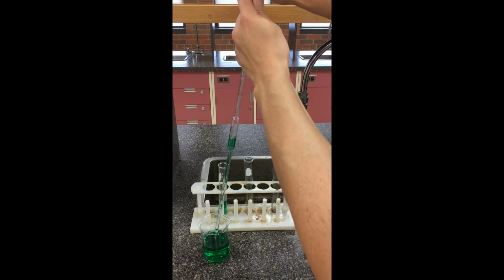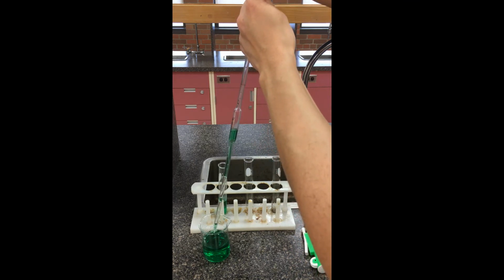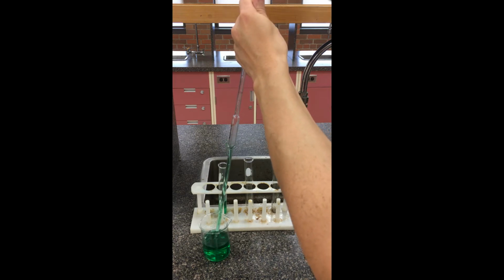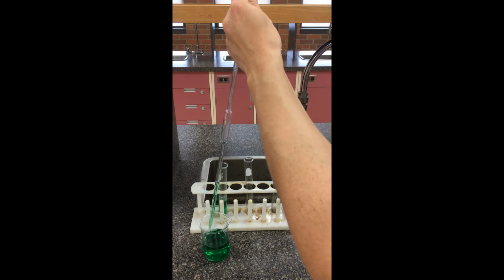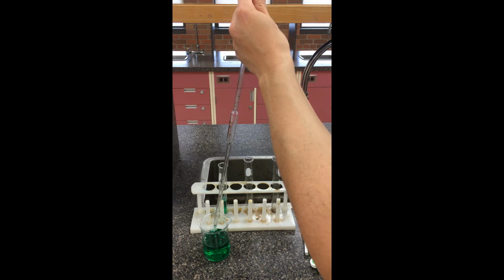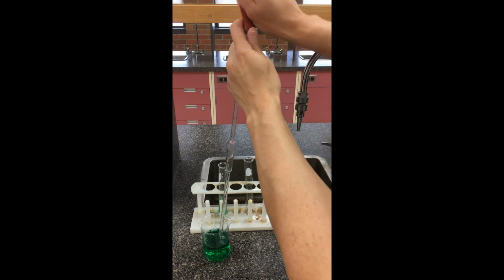What's going to end up happening is you're actually going to start sucking in air, and you now notice that it's not fully solution on the bottom there. At that point, I would just let go of the suction bulb here. I can just restart. Okay. You want to make sure that, again, the open end of the pipette here stays below the solution at all times. So let me just demonstrate this for you here.